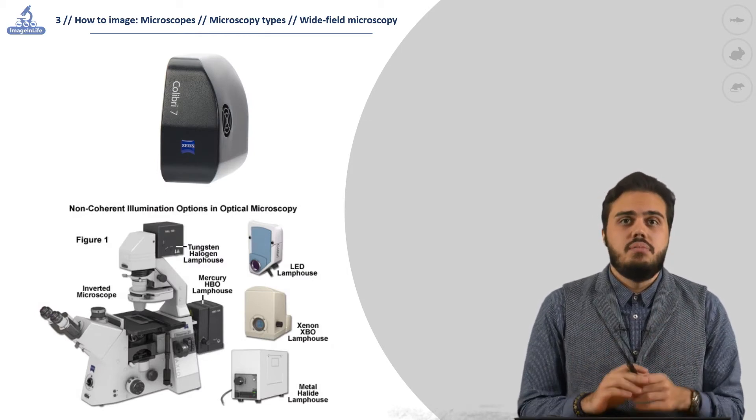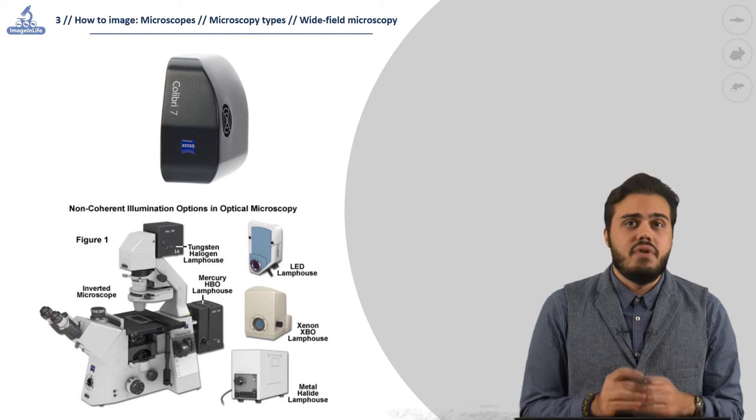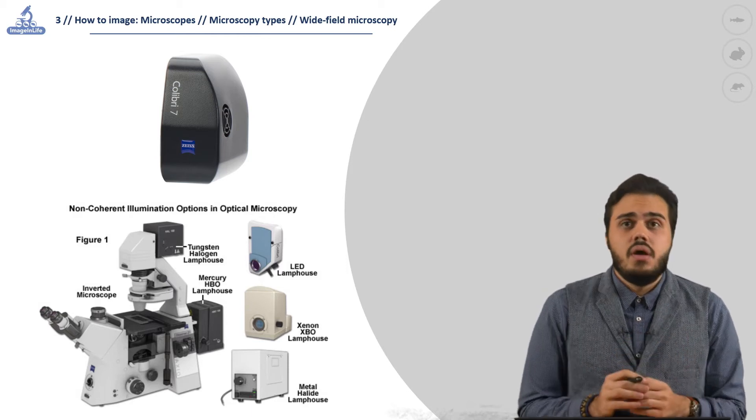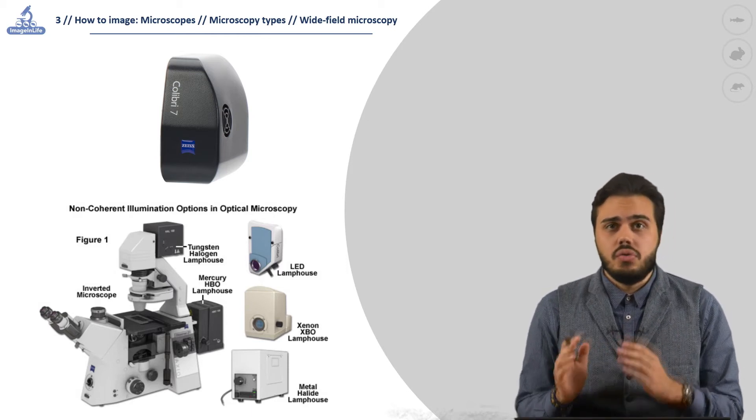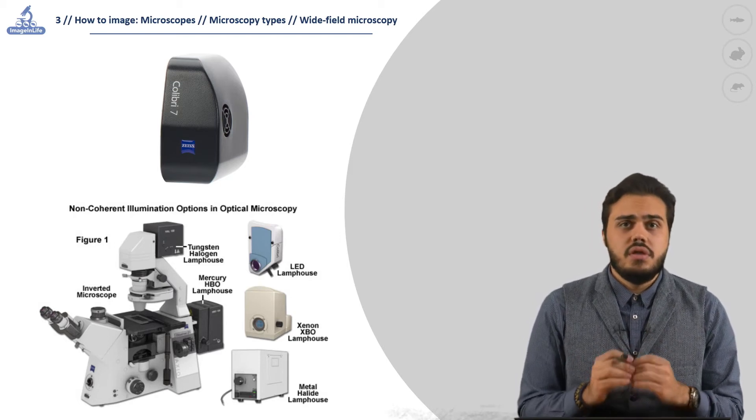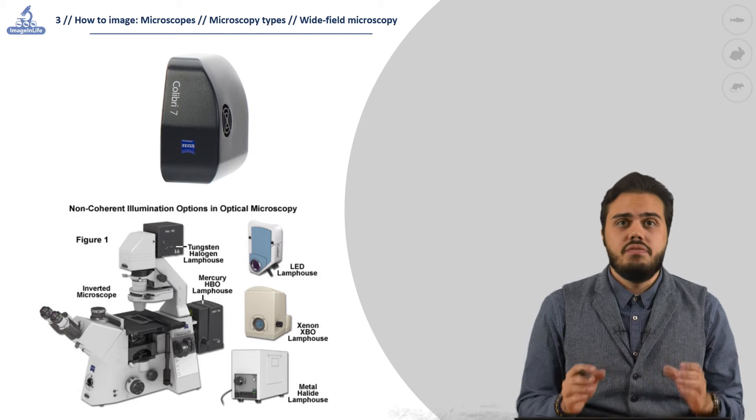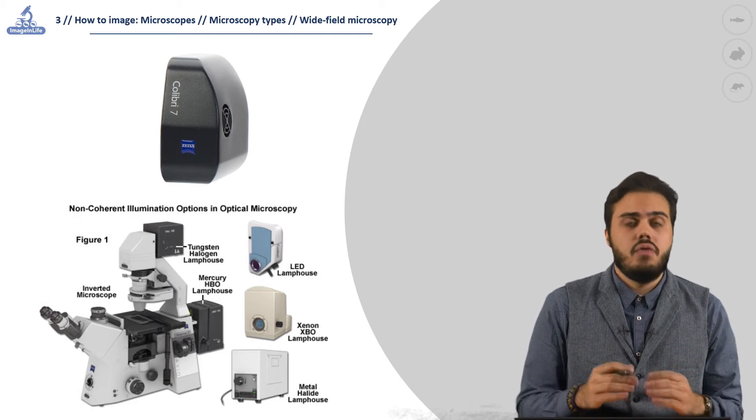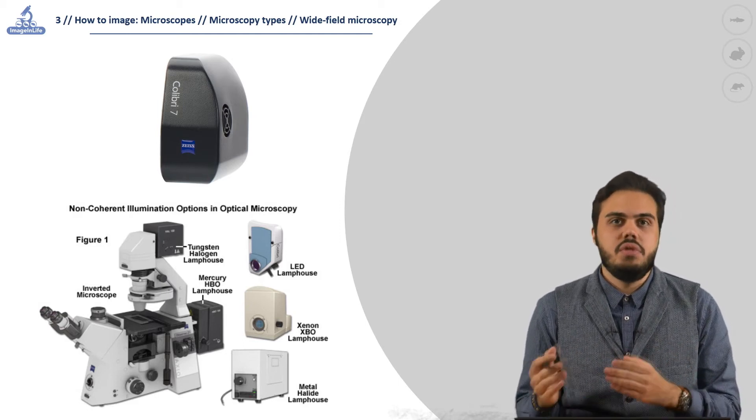The LED lamp has a broad and stable spectrum, has a far longer lifespan, doesn't need warm-up or cool-down time, and can be disposed easily with standard methods. The use of LED lamps is spreading faster with the maturation of this technology and the consequent diminishing of prices.